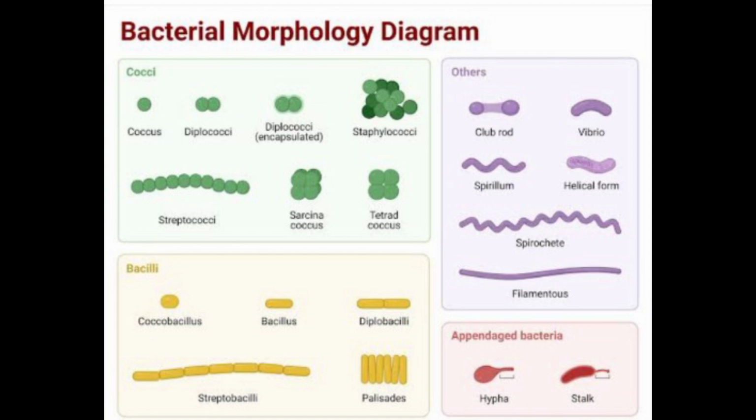The structural details of bacteria cannot be seen under the light microscope due to the lack of contrast. Hence, it is necessary to use staining methods to produce color contrast. The smear made from a bacterial culture or specimen is first dried and then fixed with heat by flaming the slide underneath. The heat kills and fixes the bacteria on the slide due to coagulation of bacterial proteins. The fixed smear is then stained by an appropriate staining technique.